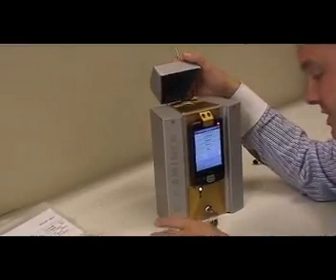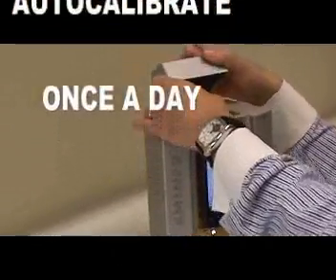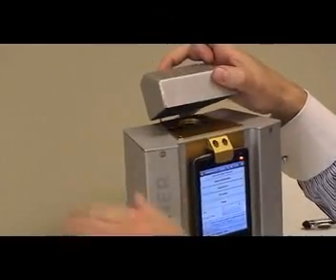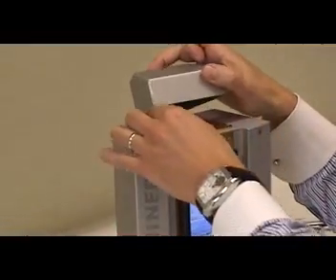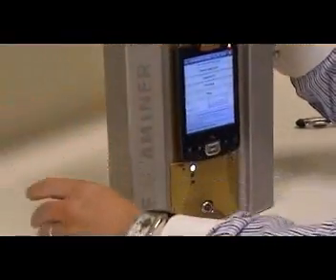You normally do an auto calibration. The auto calibration is done with this standard — you put it on here. Then you auto calibrate for about 100 seconds. For the length of the movie and in order to keep it short, I'm not going to auto calibrate it — it's already auto calibrated.